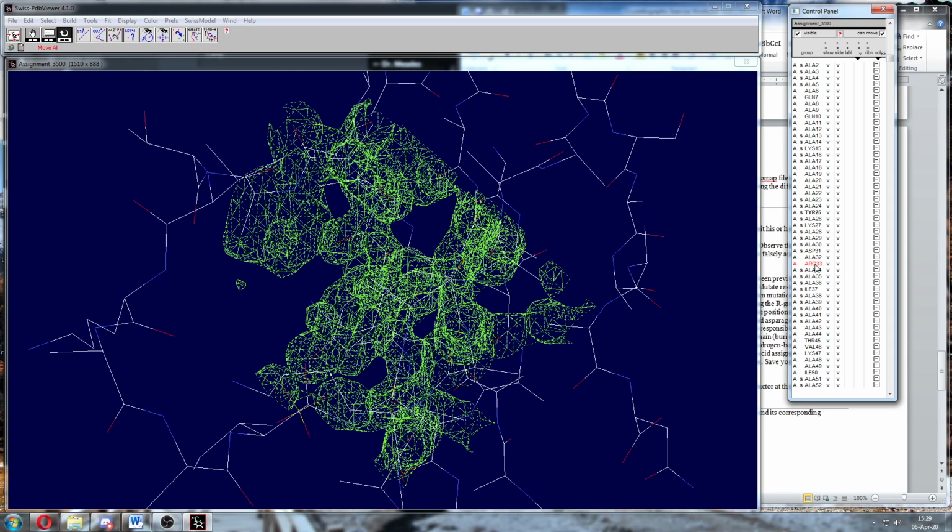When I was creating the assignment for you, I deemed some of them too difficult for you to do, most likely because they're on the extremities and the density is not very well defined. So if you see one that doesn't say alanine, leave it alone. It's correct.